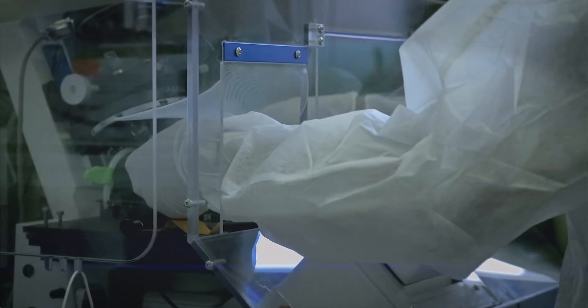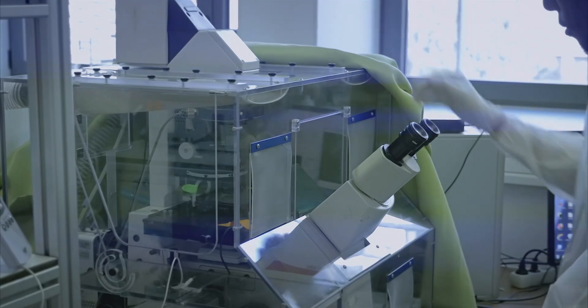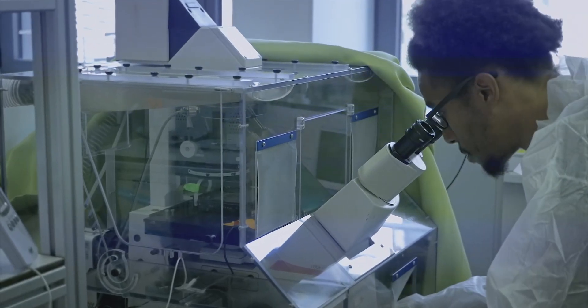But how does Brillouin microscopy differ from conventional light microscopy? What are the mechanical properties of cells and why are they important to measure?